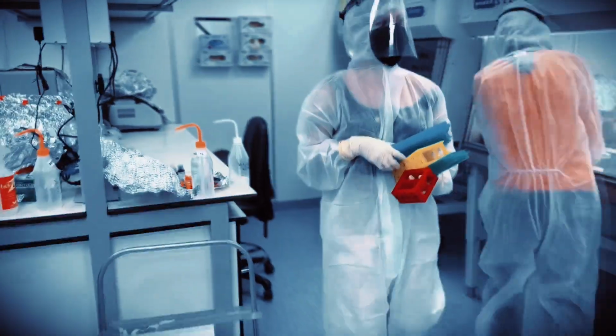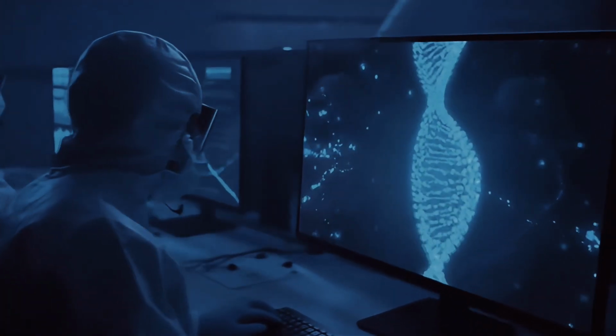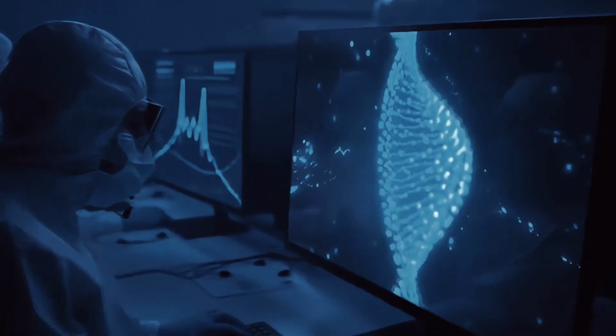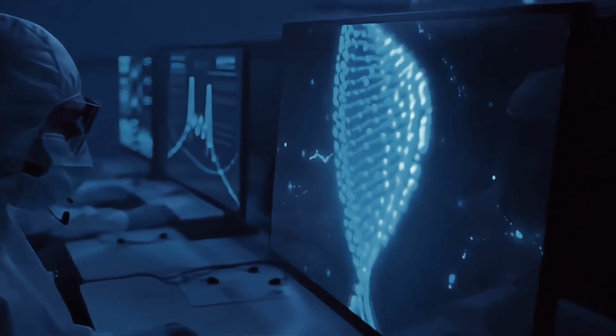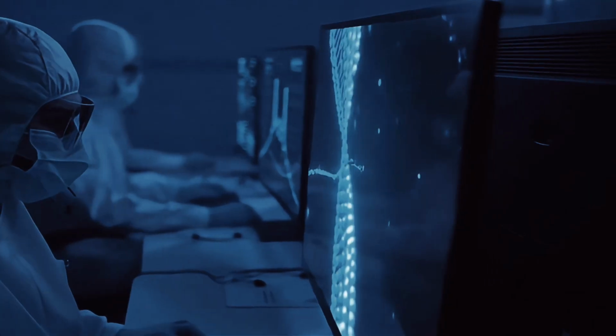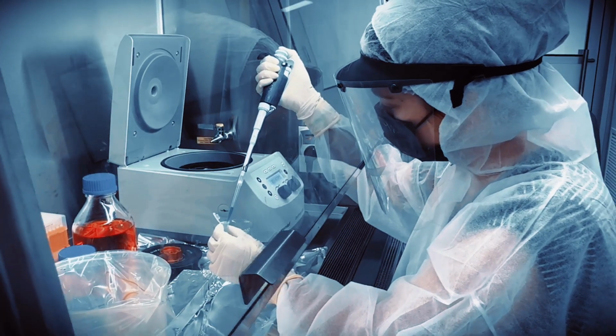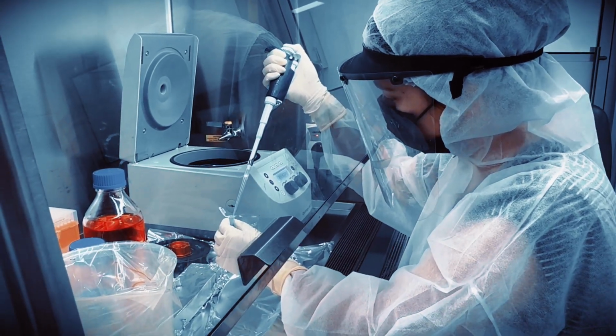After transport, the sample arrives at the clean lab, a sterile lab environment free of all pesky contamination. Here, the real detective work begins. This sample may look like plain dirt, but hidden inside are microscopic fragments of ancient DNA. To reveal them, scientists treat the sample with special chemicals that release any DNA still clinging to the sediment after tens of thousands of years.